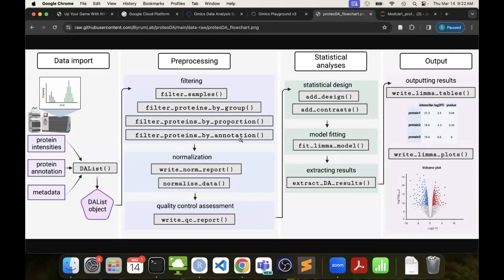So I did have a question about that. I have seen statistics on our volcano plots where some proteins only got a single value for one group, and it still takes the average and calls the others 0. Is that something different than what you're talking about? No, that's what I'm talking about.